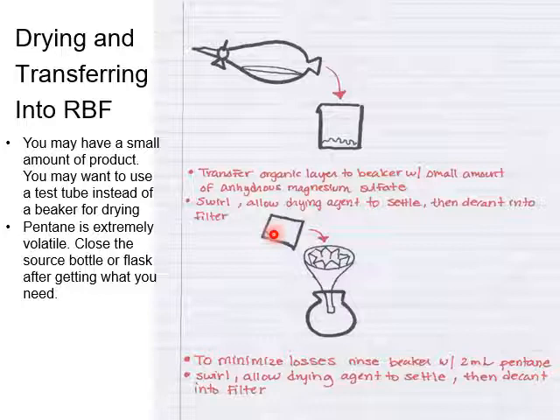At the beginning of adding the powder, you will see that magnesium sulfate dissolves in the liquid. But when you add more and more, at a point you can see that the magnesium sulfate will not dissolve, and you will have some extra powder. That's the point, which means it's enough. You don't need to add more.